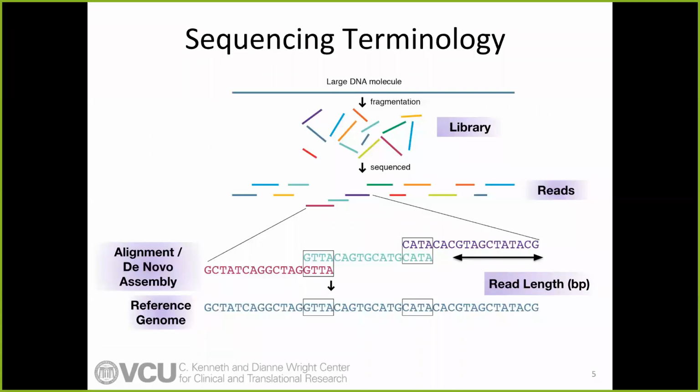I'm going to move through the introductory slides a little bit quickly because a lot of it's quality control and somewhat boring to a lot of people. But it's very important that you understand everything that goes through processing sequencing data because it is a lot. So the first thing is just sequencing terminology if you're not familiar.